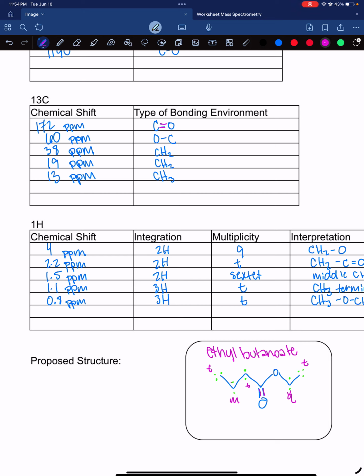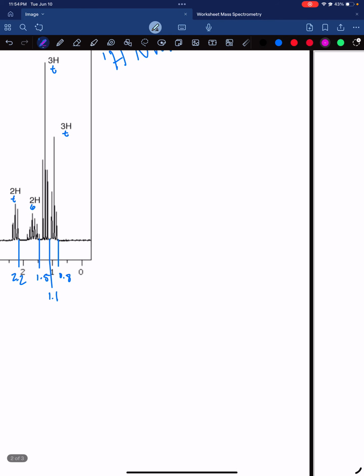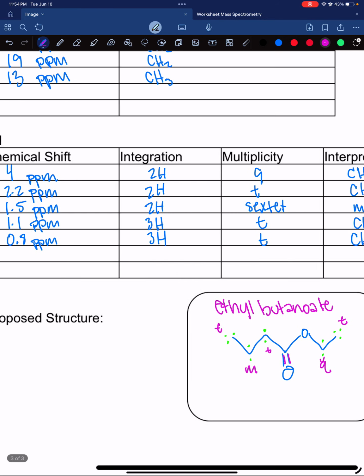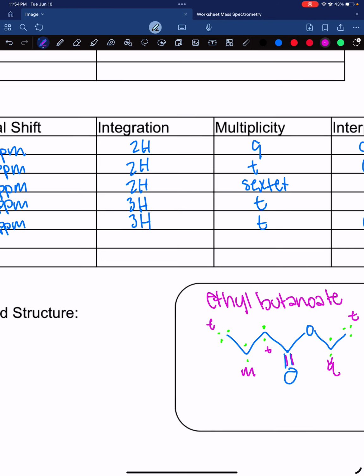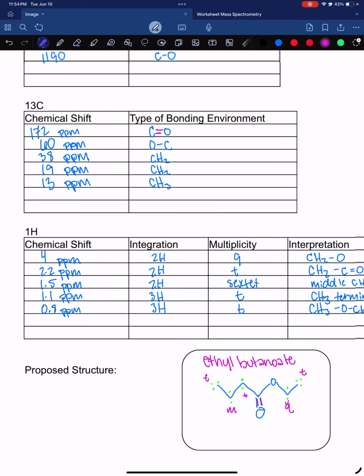For these hydrogens here, it is a multiplet because we have 5, so N plus 1 is 6, and that's the 6 that I mentioned earlier, just to keep in mind how many hydrogens I will be on the lookout for in my final structure. So that's my multiplet, and then here on the end, this CH3 has 3 hydrogens, and it only has these 2 hydrogens next to it, and that is a triplet.